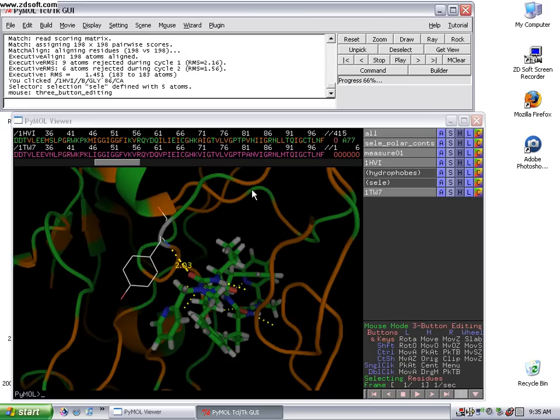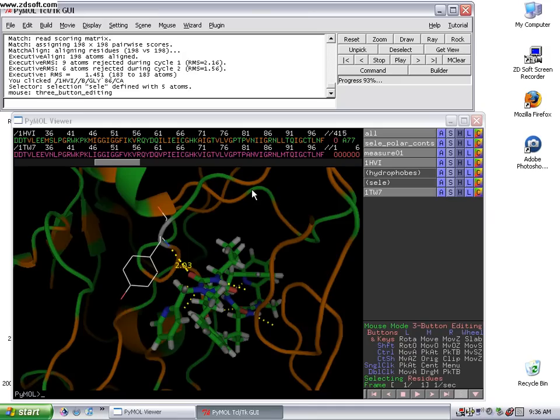if you move the structure even slightly, it'll take the rendering away. What Ray does is it simply renders all the shadows and brightens it a little bit so you can see the work you've done to make the image look good.